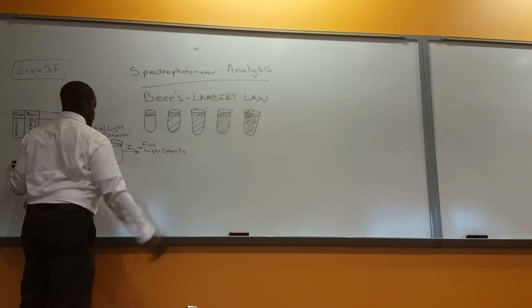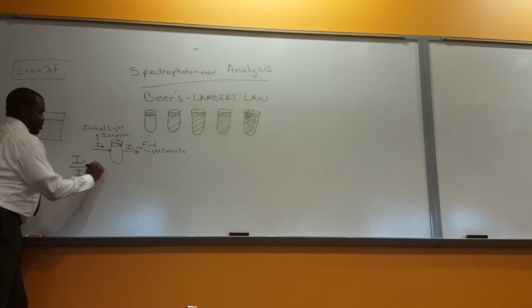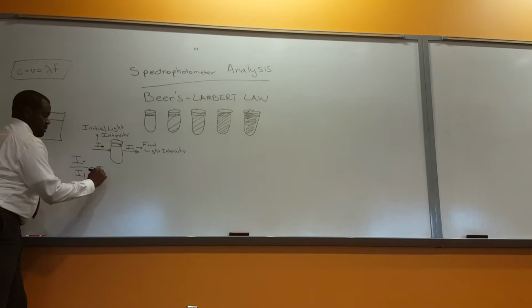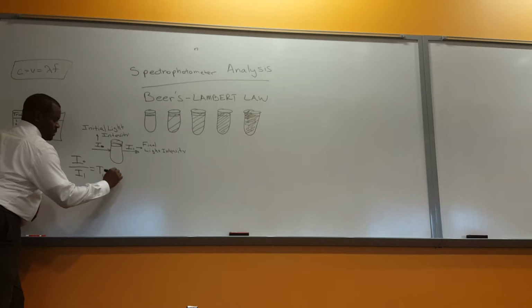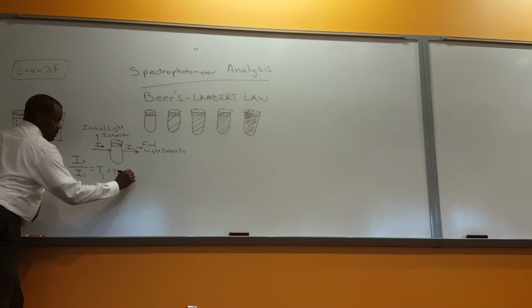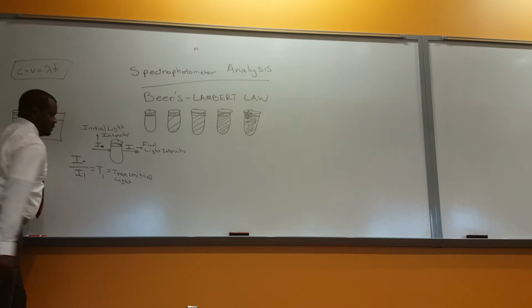That equals my first transmission. We'll call it T1. So that's transmitted light.